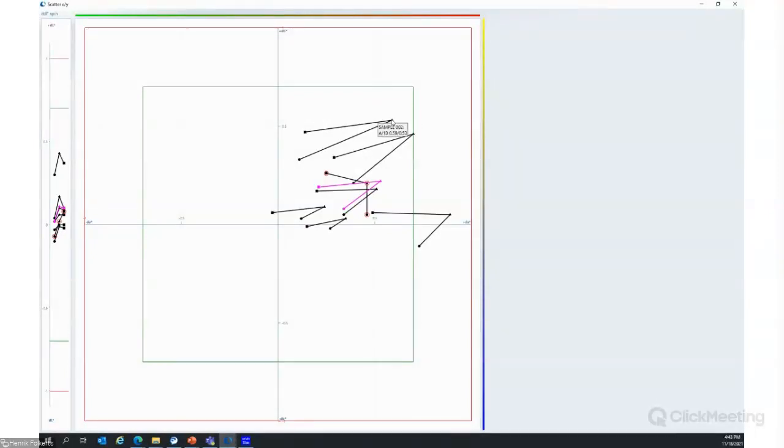This is the result for sample number 2 for A. And this is the result for sample number 2 for D65. You see, there is a difference from here to here. This is an indication that you may have metamerism within your standard compared to the sample, because this distance is bigger.